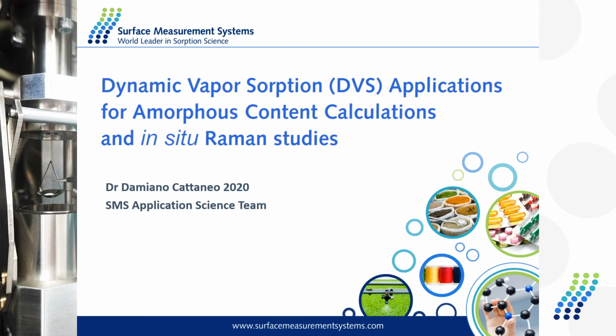And today I would like to guide you through a presentation on the application of DVS for amorphous content, BET surface area, and Raman studies. The presentation will be divided into two main parts.